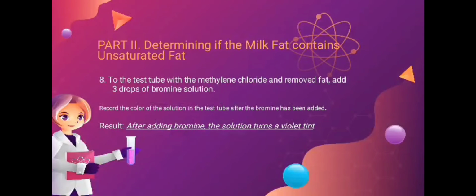For Part 2, determining if the milk fat contains unsaturated fat. To the test tube with the methylene chloride and removed fat, add 3 drops of bromine solution. Record the color of the solution in the test tube after the bromine has been added. For the result, after adding bromine, the solution turns a violet tint.